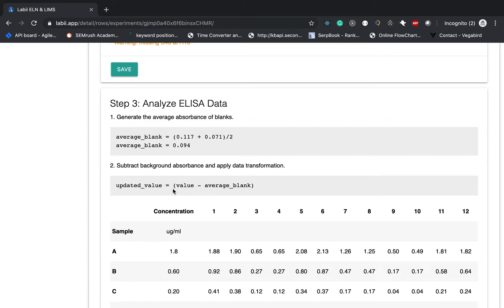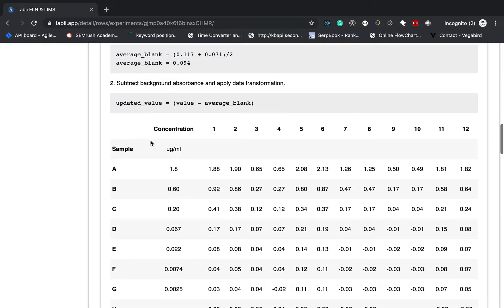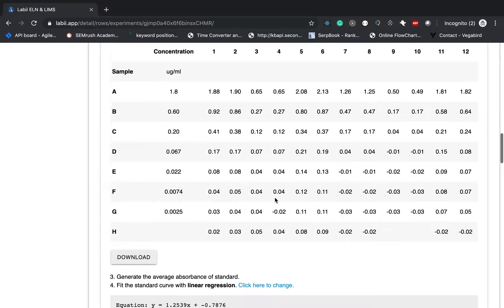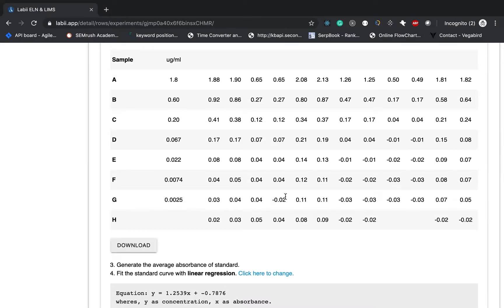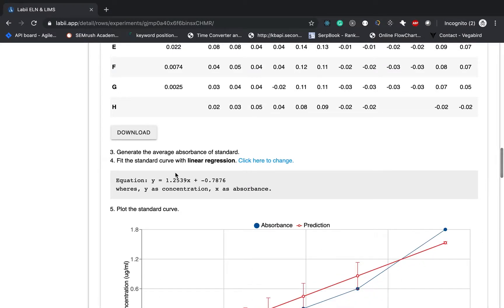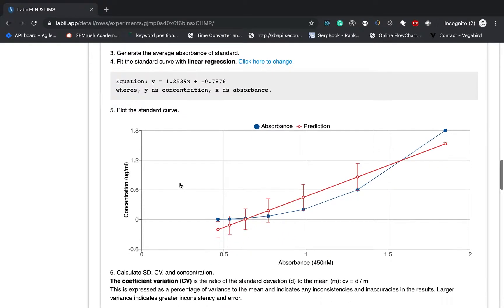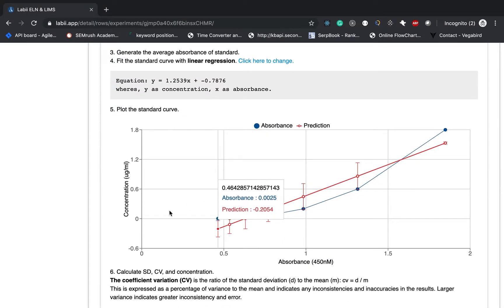So let me go through all these steps. The first step the lab is going to do is average the blanks for you. And then subtract the background. Give you the new value. You can always download the list value to using other software to do the data analysis. Then we will do the standard curve fit with the linear regression and give you the plot.